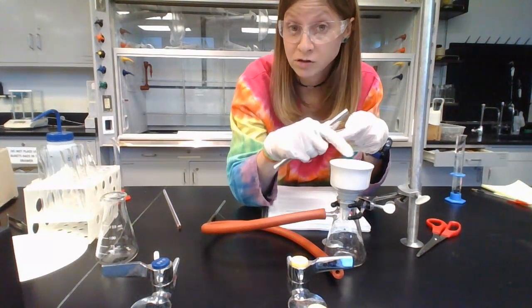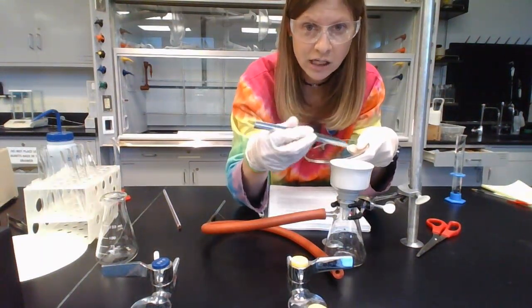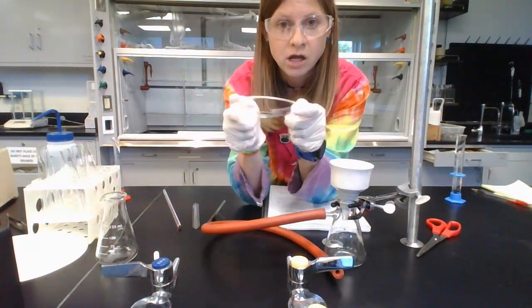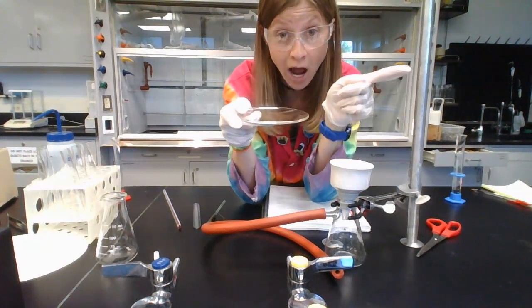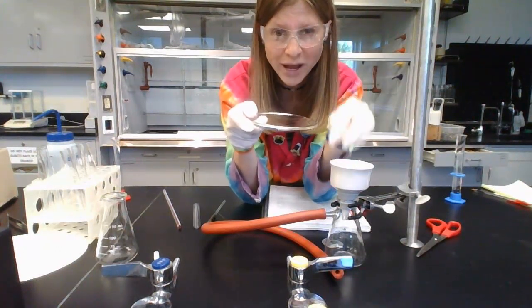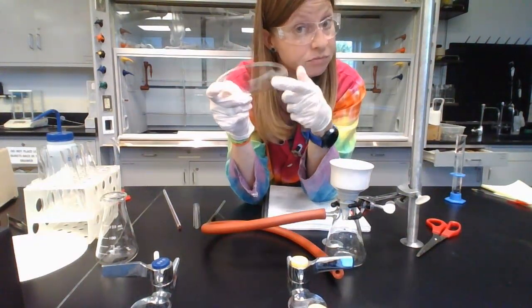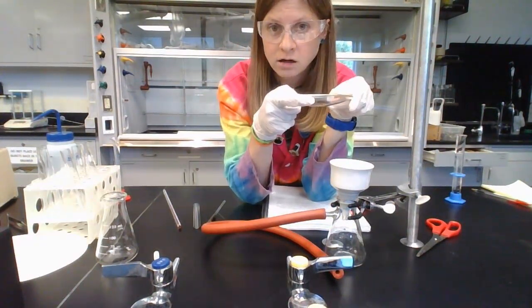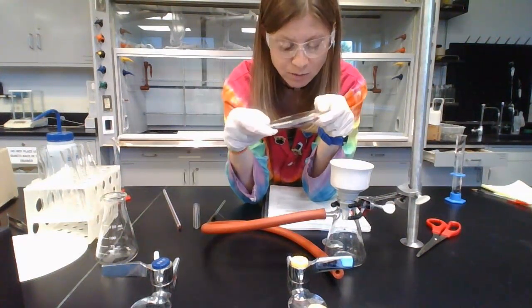And actually, we do have a use for this. So we do need to leave at least a little bit of solid behind. But you're going to transfer it all into here, and then it needs to go in the oven. We're not measuring the mass of it yet. We don't measure the mass of it until after it's dry. Okay, so we take the wet solid, put it on here, where I already did measure the mass of this when it was empty. And I put it in the oven, and it's going to dry for 30 minutes. So you'll have to keep track of time so you know when it's been 30 minutes.